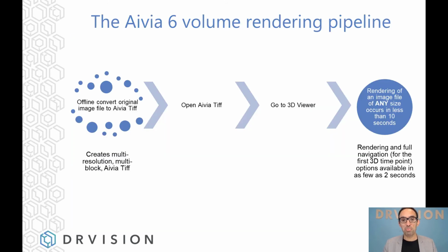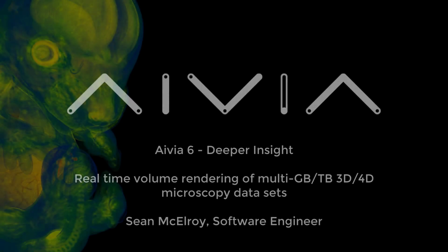And with that, I will pause and invite Sean to come and give us his view on the work that he's been doing together with Bryce and Chris. Thank you, Sean. Thanks, Luciano. That was great. All right. Hi, everybody. My name's Sean McElroy, and I'm one of the engineers here at DR Vision. We're working on Aivia 6 and the new rendering engine.